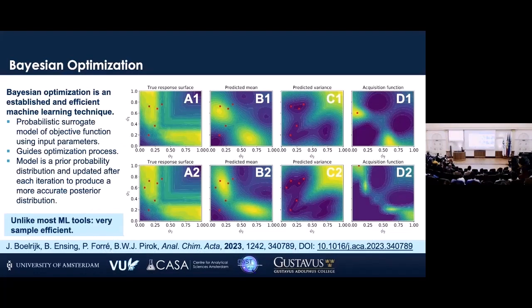So now suppose that I just am optimizing a method that starts from a certain gradient point to a different gradient point. So remember we said we had a reverse phase separation that went from 0% acetonitrile to 100% acetonitrile. So P1 is, for example, the 0, and P2 is, for example, the 100. Right, so I'm only trying to optimize these 2 points in this hypothetical example. Now this surface over here represents basically what is ideal. So the actual result.